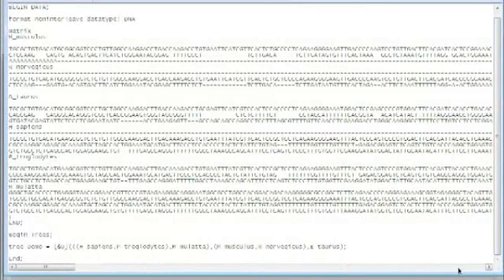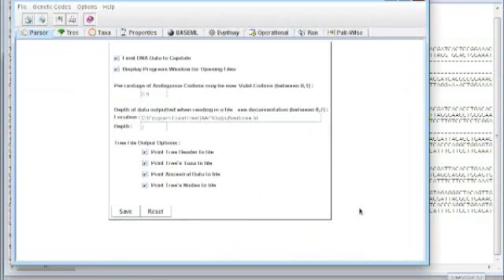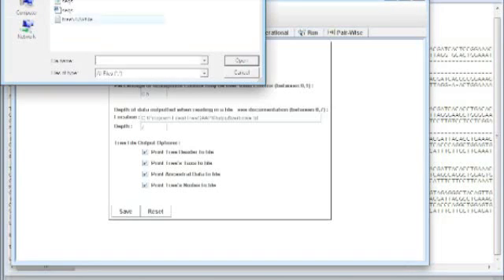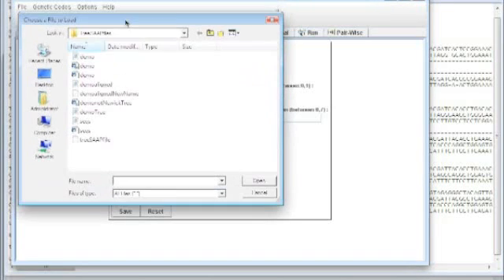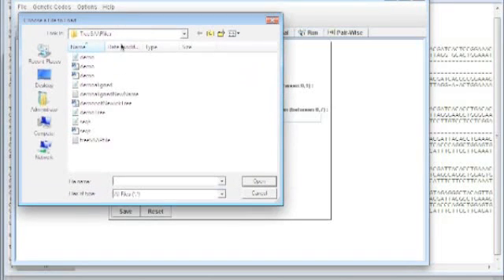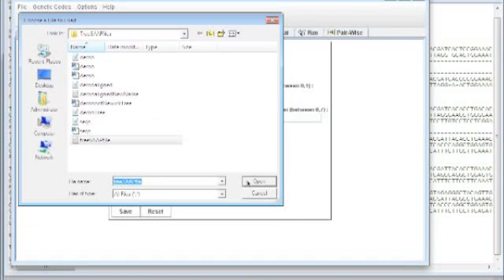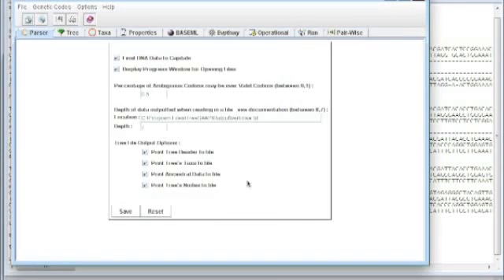So when you open up TreeSAP, when you bring it up, you should see this window right here with lots of tabs. You can either do file open or you can just click this button to open a new file. I'm going to select this TreeSAP file here. Open it up here. It will take a second to read everything in.